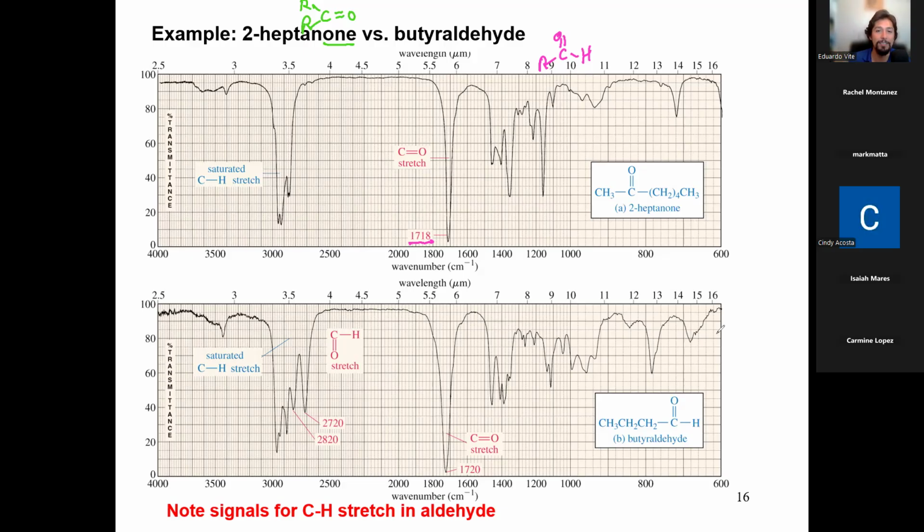If you don't have it, you don't have any of them. You can't, because the signal is not there. And now you can guess other functional groups. So it's very important that we know what the signal looks like and where to find it. I say go to 1700 and start looking around. If you see something very sharp, very strong, you have a carbonyl. And then the next question becomes, what kind of carbonyl?